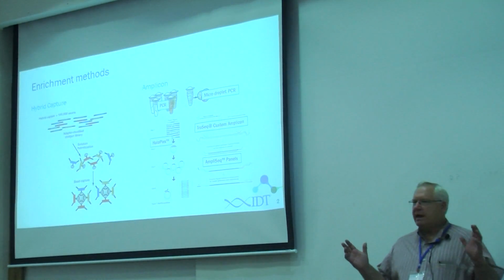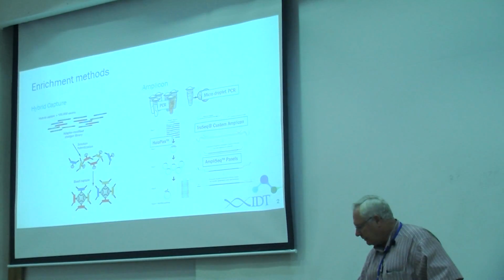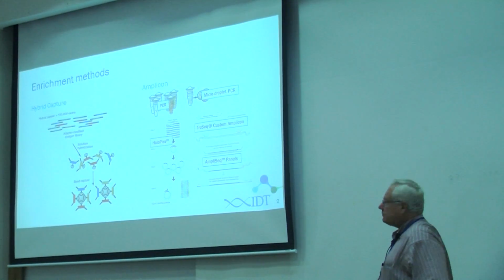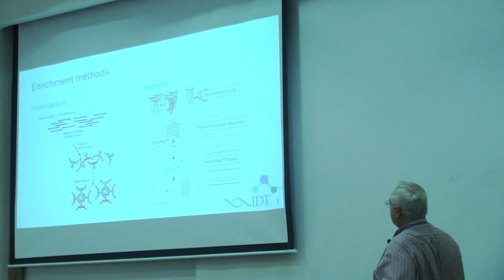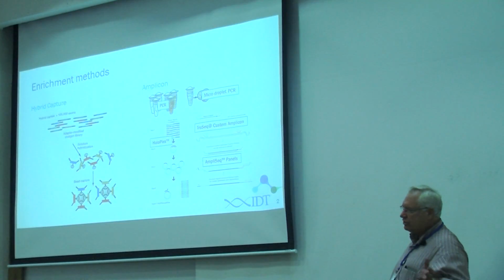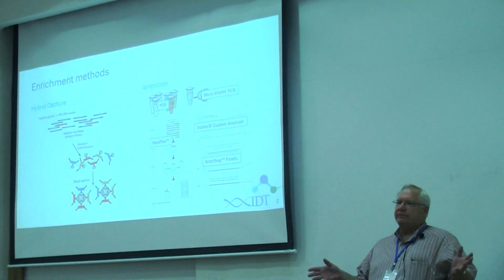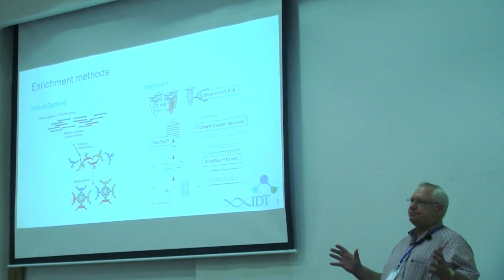So how do you enrich? How do you narrow down the sequencing space so you're only sequencing the stuff you care about? And pretty much there's only two ways to do it. One is capture, the other is amplification. So in amplification, you use a PCR-based method, whether that involves a MIP-type or Haloplex ligation event followed by amplification, or just PCR-based things, where you throw in a multiplex reaction and PCR amplify some fraction of a genome.